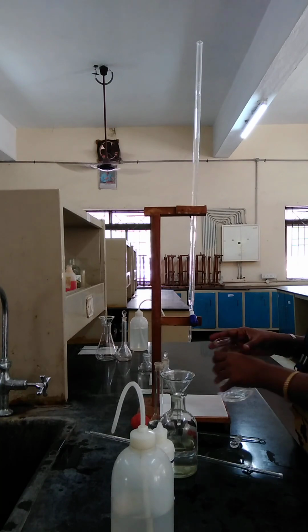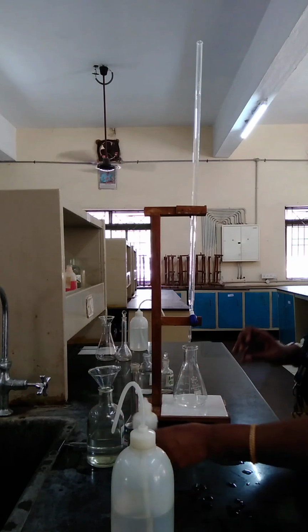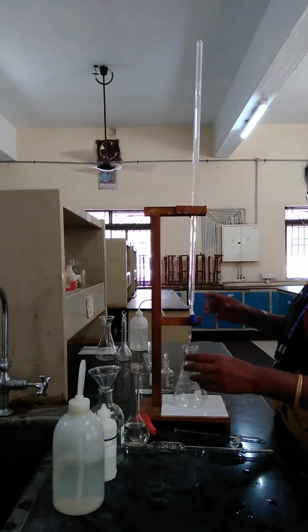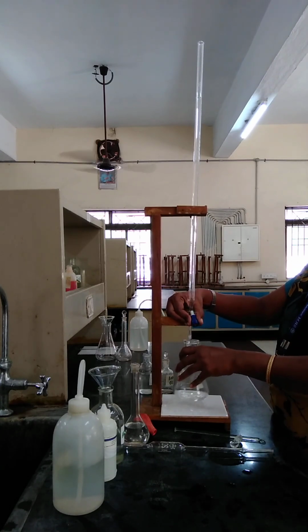Now slowly do the titration against the sodium hydroxide. The endpoint, we know very clearly, is the appearance of pink. Okay, pale pink.